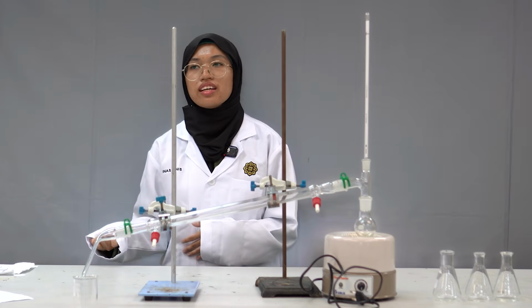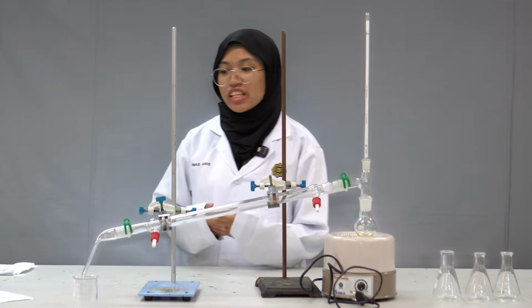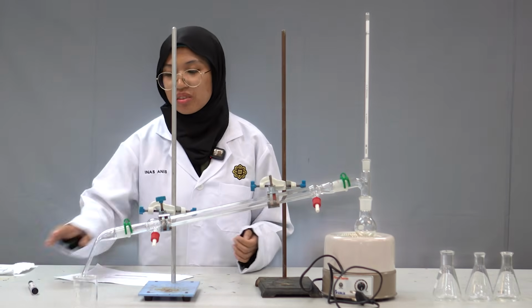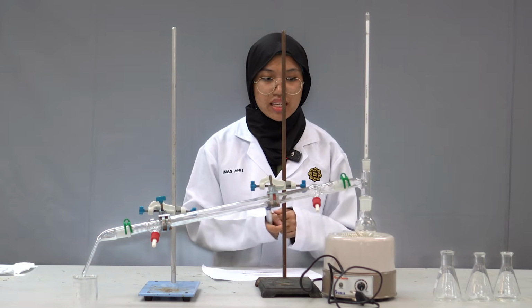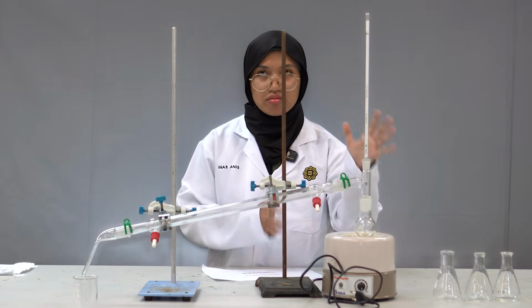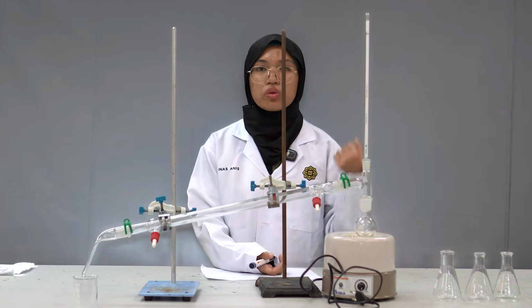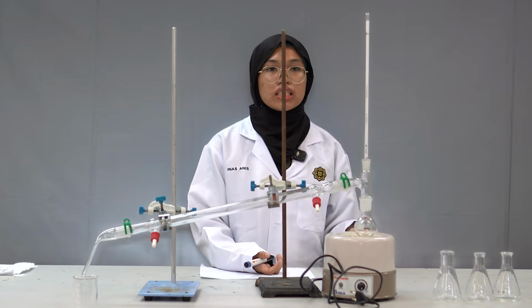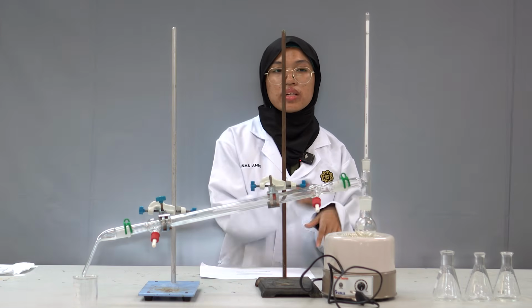Moving on, I will explain the procedure of a simple distillation we can do in a lab. Before we heat up our mixture, the first thing is we prepare the mixture of DCM, dichloromethane, as well as base.